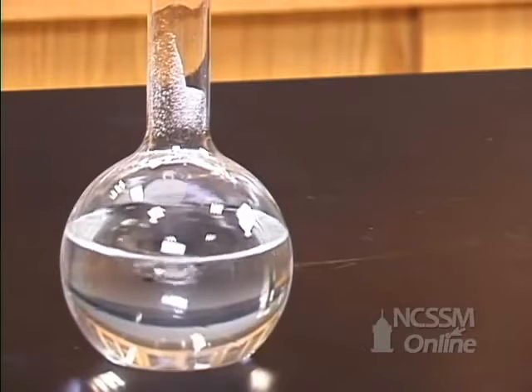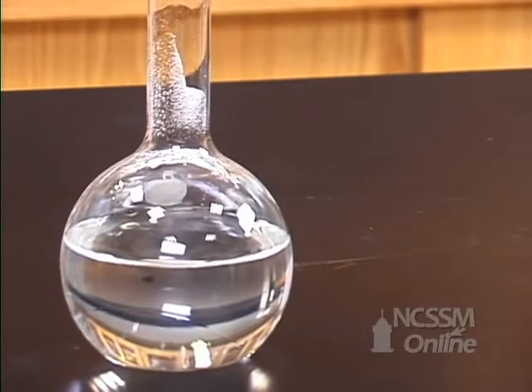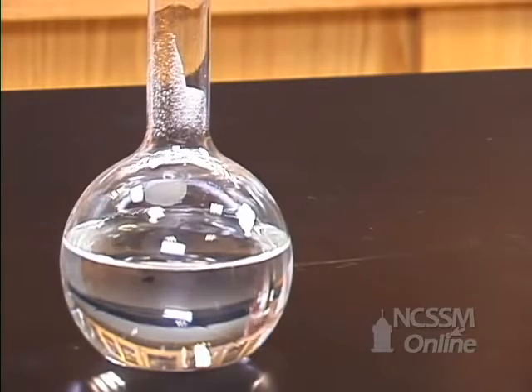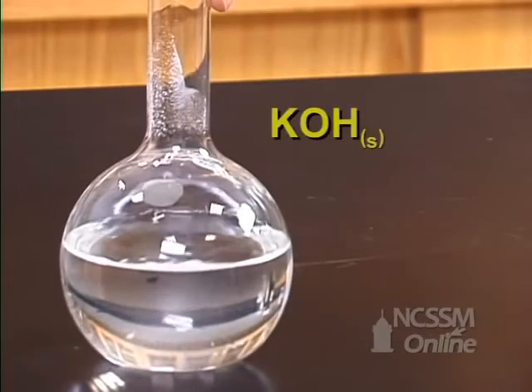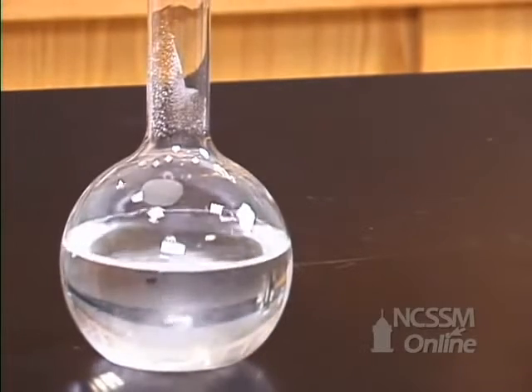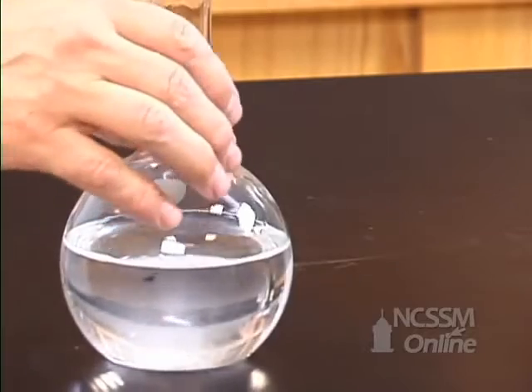Glucose is a sugar. Glucose reacts with the oxygen in the air slowly to produce carbon dioxide and water. If I add some potassium hydroxide, the potassium hydroxide acts as a catalyst to speed up the rate at which the glucose reacts with the oxygen in the air.